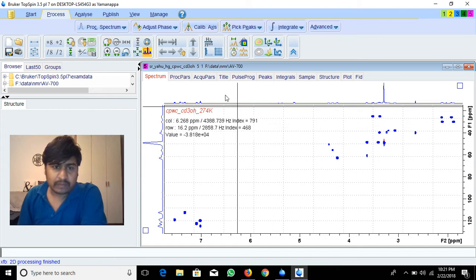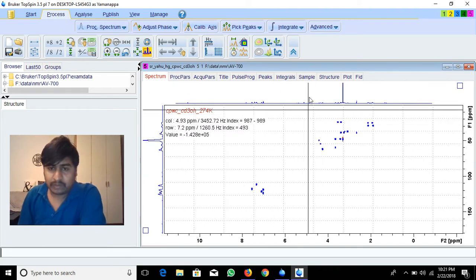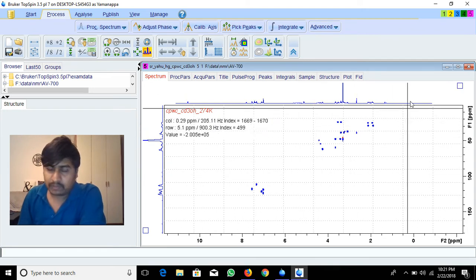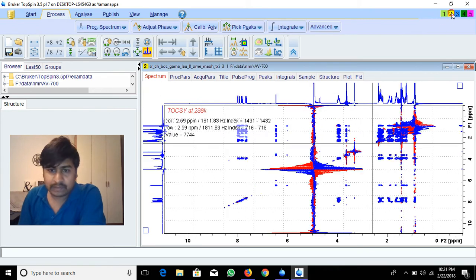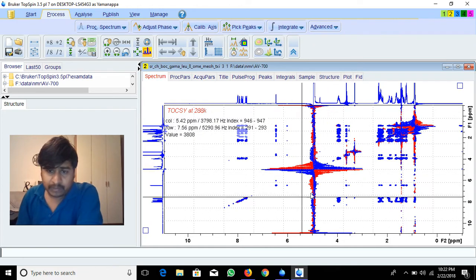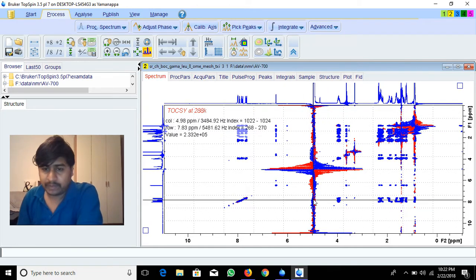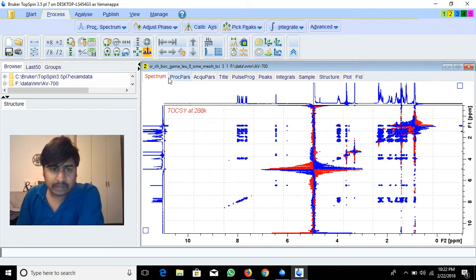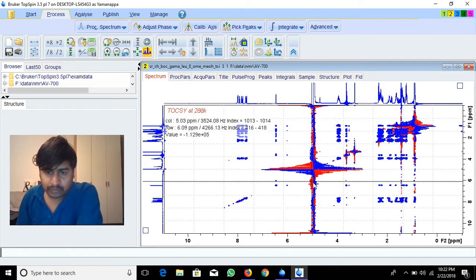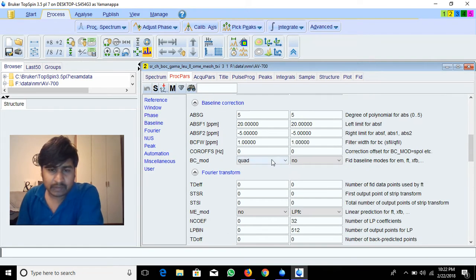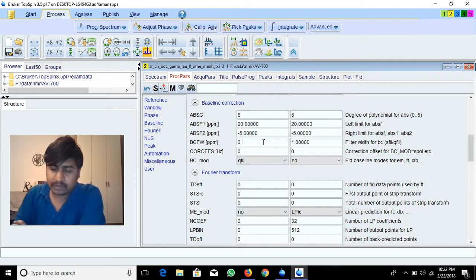After doing the experiment we can also suppress the offset noise — the noise below the water peak. Here is a TOCSY example where the noise is suppressed badly. Because of poor shimming you will get this noise below the water peak. Again the same approach: go to Process, change BC mode from quad to qfill, keep 1 ppm, and set the width to 0.5.